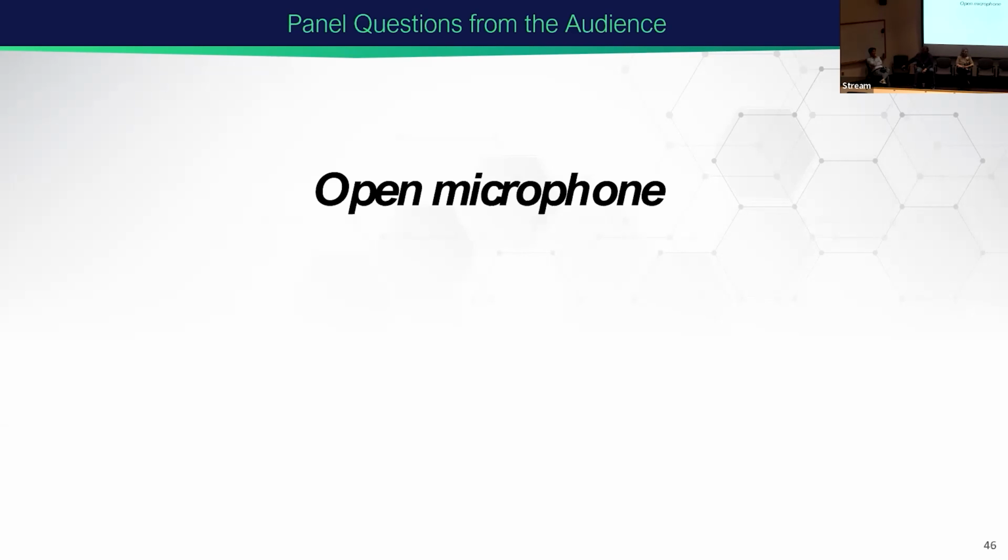I want to piggyback on that comment too. We also see a lot of effects with sample type itself. Even if you've got some benchmark study where you've determined the optimum, let's say you go with an unsupervised approach, so you don't even have data that you're feeding the model to train it and test it. Even with an unsupervised approach, you could see effects where it works really well with one data type and not with another.